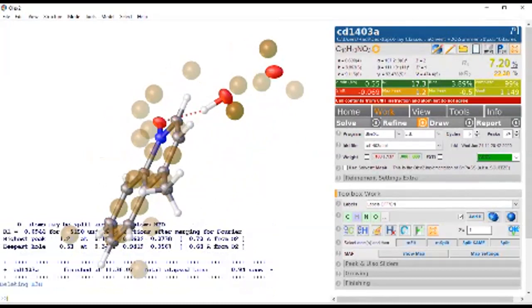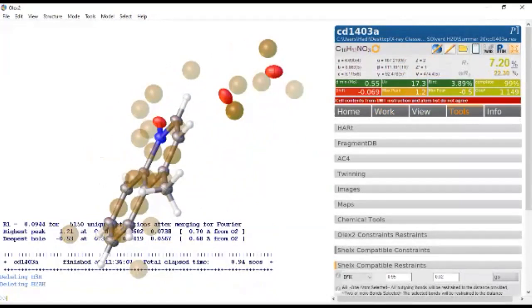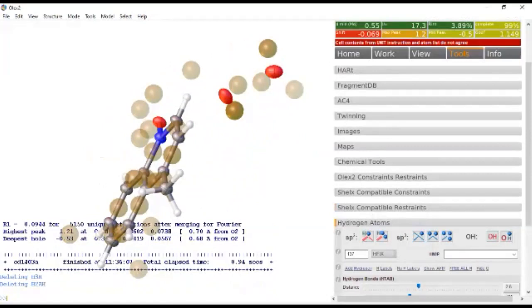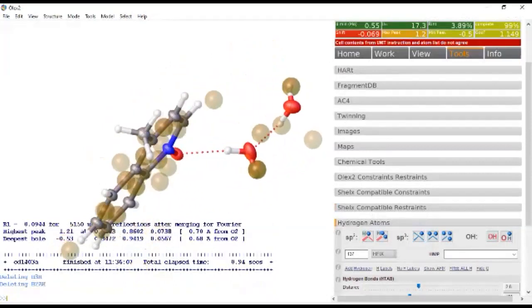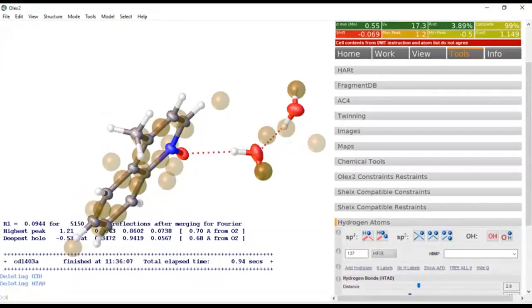So then you can come back and we can try to do the add hydrogens again. So we come down here. So this one did a little bit better job of adding the hydrogen. See, now we don't have those two hydrogens running into each other, and you also notice that the hydrogens that we calculated fall on these electron density peaks. So these line up quite well. And so now we'll do a refine.